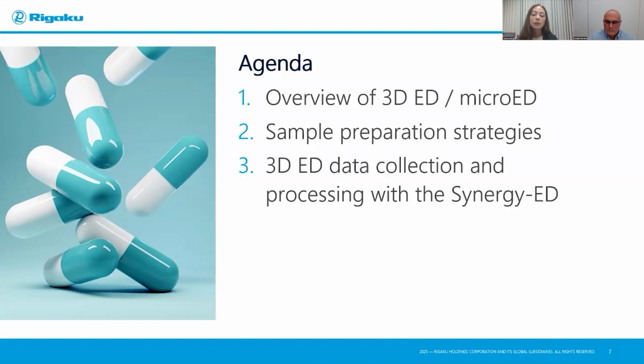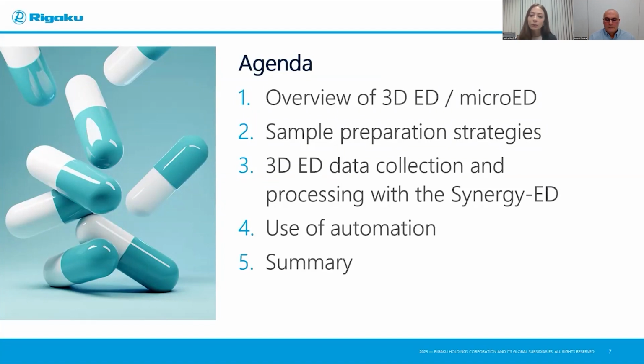From there, we're going to discuss actual data collection and processing with the Synergy-ED, both the overall workflow, as well as recordings of actually doing this in real time. After this, we will see how automation is already fitting into our workflows routinely with the Synergy-ED. And lastly, we'll end with a summary going over everything that we discussed today.